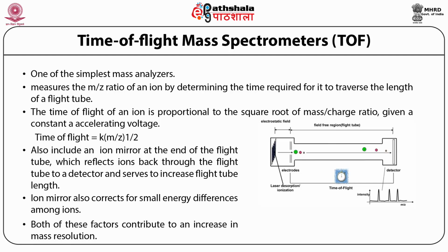Figure 3 shows the representation of a MALDI along with the TOF analyzer.